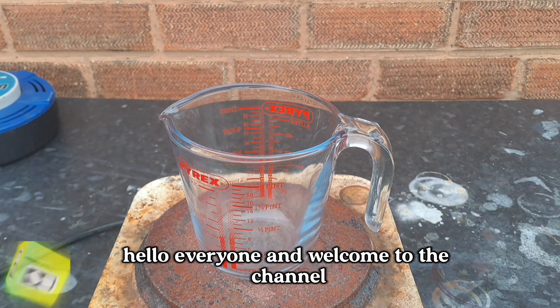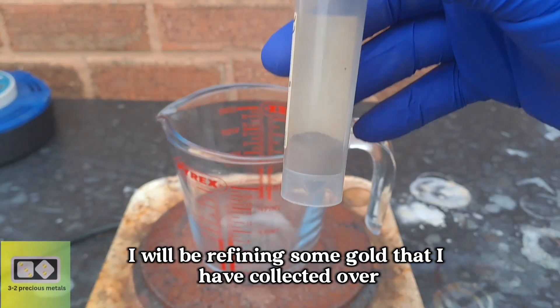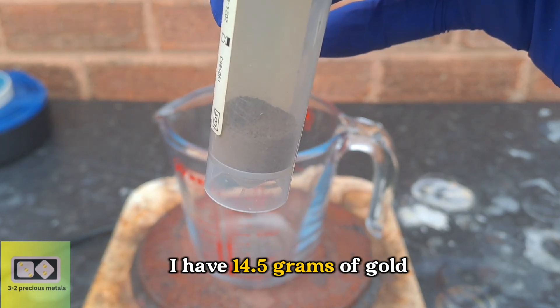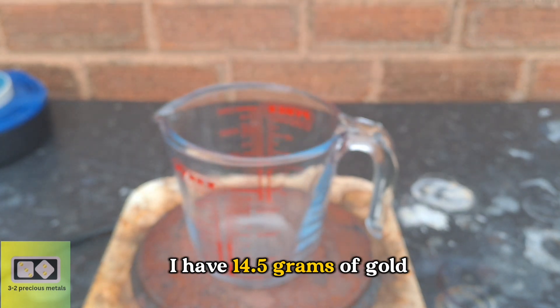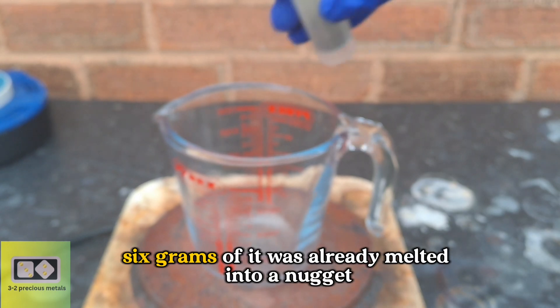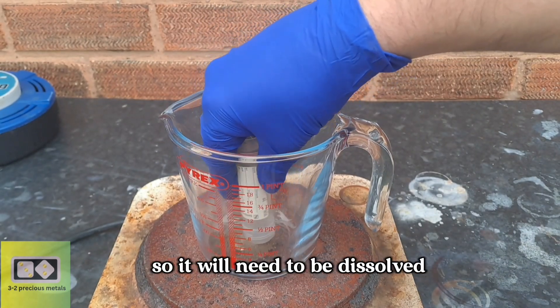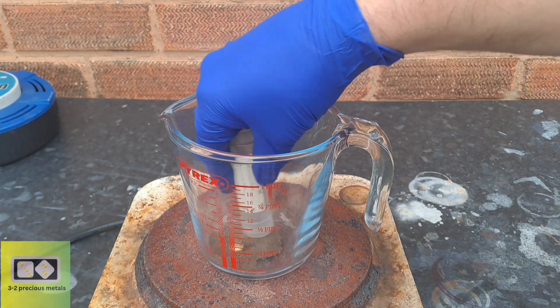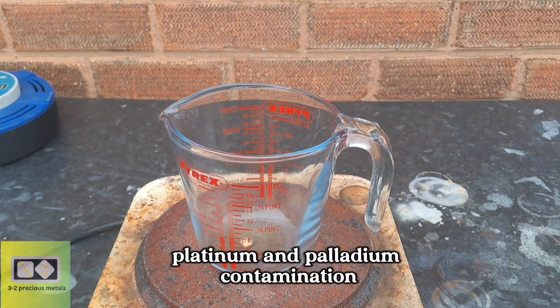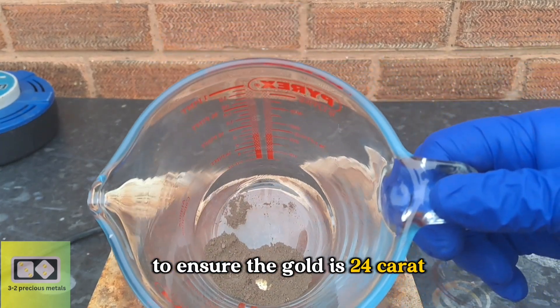Hello everyone, and welcome to the channel. In today's video, I will be refining some gold that I have collected over the year. In this container, I have 14.5 grams of gold that has all been taken from e-waste. 6 grams of it was already melted into a nugget, but it wasn't refined first, so it will need to be dissolved. I'm expecting there to be some silver chloride, platinum and palladium contamination, and this all needs to be removed to ensure the gold is 24 carat.